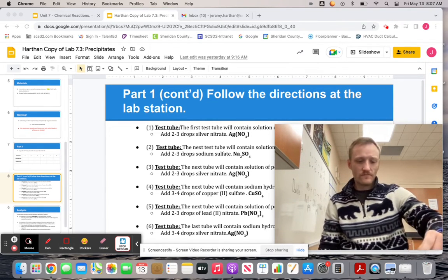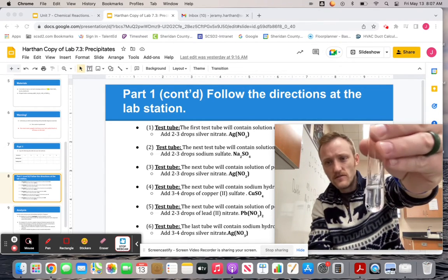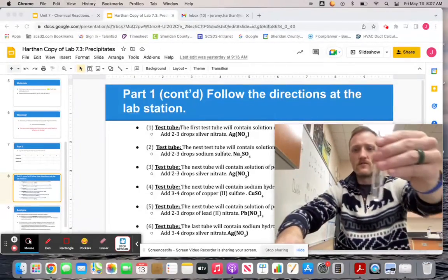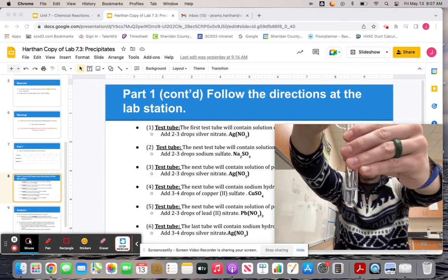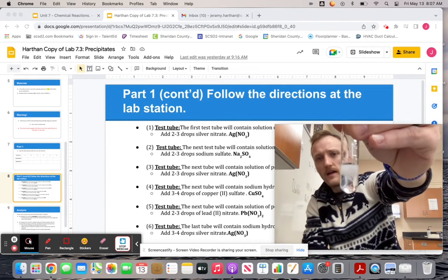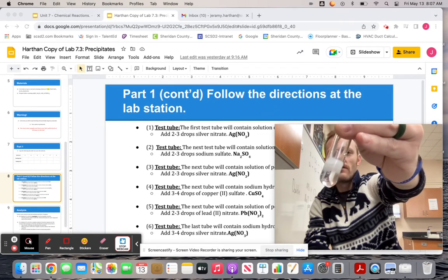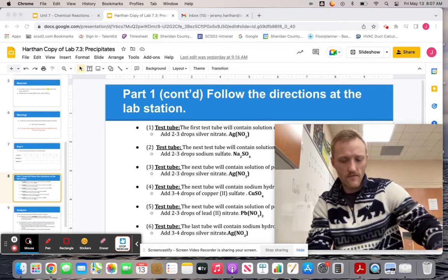Okay, so now next one. Next one we had barium chloride, or BaCl2, right? Again, we got a nice clear liquid, and we're going to mix that one with sodium sulfate. Again, another nice transparent liquid. Okay, when we do that, again, look at that. Wow. And so we can see there that, again, something is forming in that solution that is insoluble, meaning it doesn't dissolve. And so that's why we can see it now. It's forming a solid. Go and record your observations on that one.